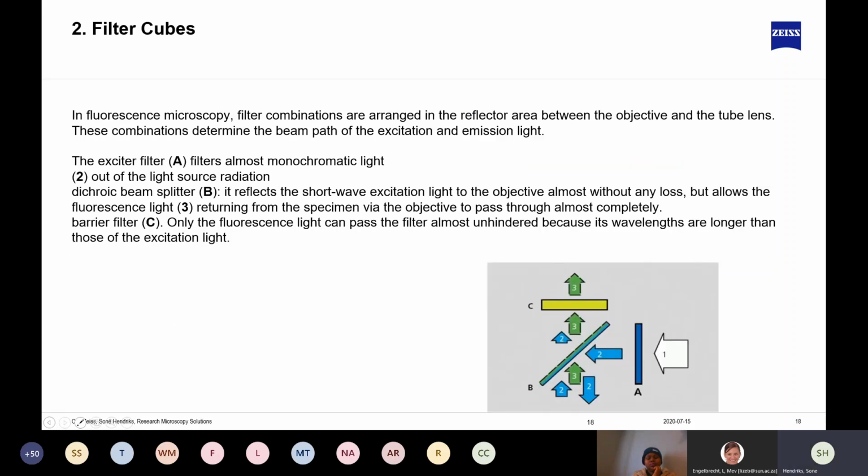All right. I've already spoken about and explained the principle of a fluorescent cube. The only thing that I'd like to add here is that it is quite important to know, as I've said, the excitation and emission wavelengths of the dyes or the molecules of interest that you want to work with, because it can be a limitation if you choose the wrong filter cube, or you cannot give that type of information to the person that helps you set up the system.